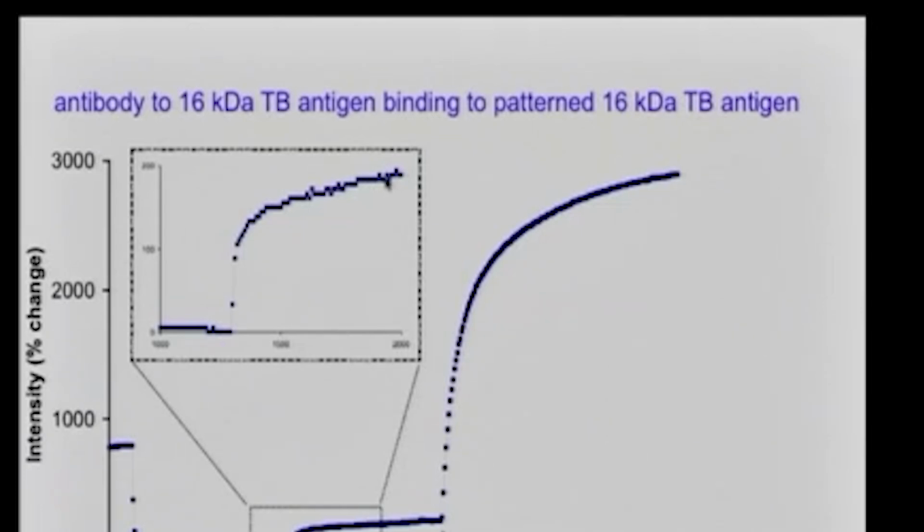But in case you want something that's much more obvious, something that you can see, because at this point, when you have the precipitation, you can actually see the signal already. We introduced the HRP goat anti-mouse and the TMB substrate here, and you can see the enhancement in signal. This is a very big intensity change. This is reading at 3,000, so it's a 3,000% intensity change.